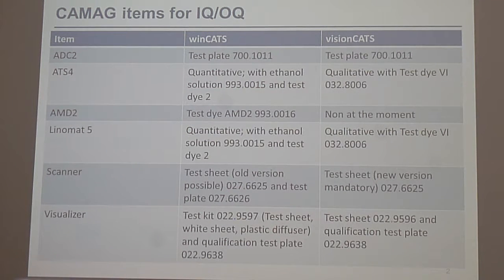If you are lucky, the sheet will pass well and everything will be perfect. But with the old one, very good, you could have a yellowish sheet and it was still working quite well, but here not.